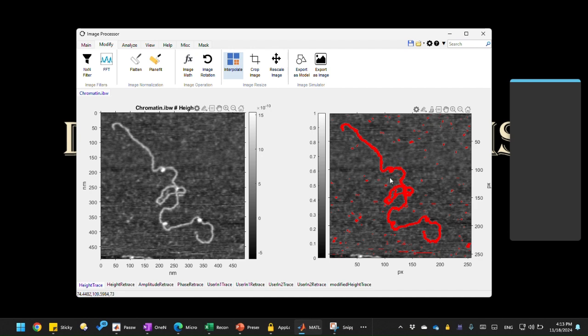Traditionally, it's not possible to do with particle analysis because if you mask the protein and its DNA inside this cutout, it's going to mask the whole DNA. So essentially, it treats the whole DNA as one single particle. But we want ideally three cutouts. We want to analyze three particles, right? So we can't do this in the traditional particle analysis.